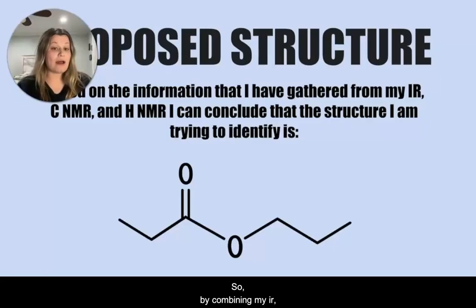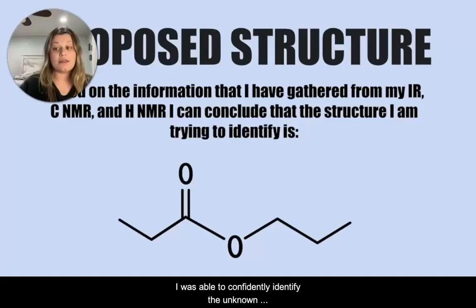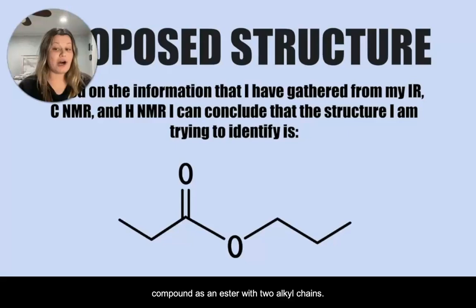So by combining my IR, my C NMR, and my H NMR data, I was able to confidently identify the unknown compound as an ester with 2 alkyl chains.